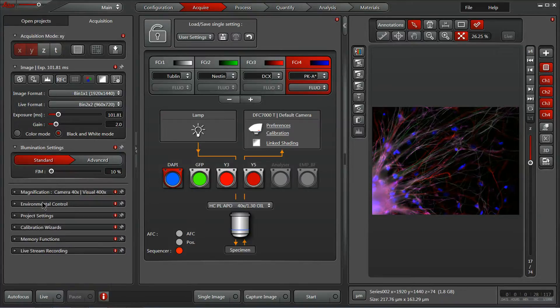We also have access to environmental controls, project settings, a calibration wizard, memory functions, and the ability to do a live stream recording directly here within the acquisition tabs. So, let's take a look.